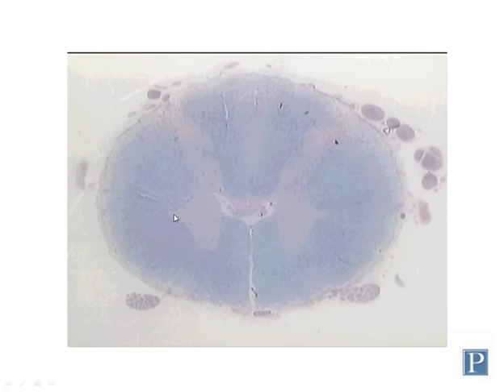And if you look carefully, you can also see two smaller horns projecting from the lateral sides here. These are called the lateral horns. The ventral horns contain neurons that are responsible for controlling motor function, such as innervating skeletal muscle. The dorsal horns contain neurons that process sensory information, and the lateral horns process autonomic motor function, such as those controlling smooth muscle and involuntary secretions by glands and so forth.